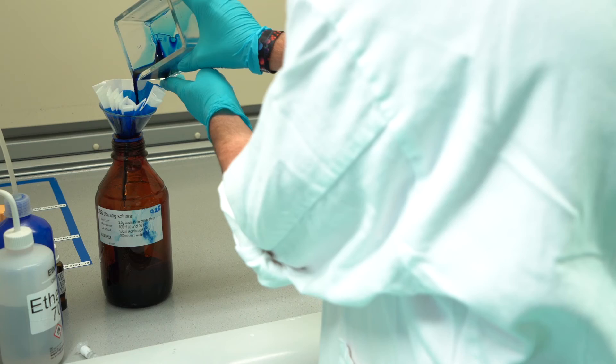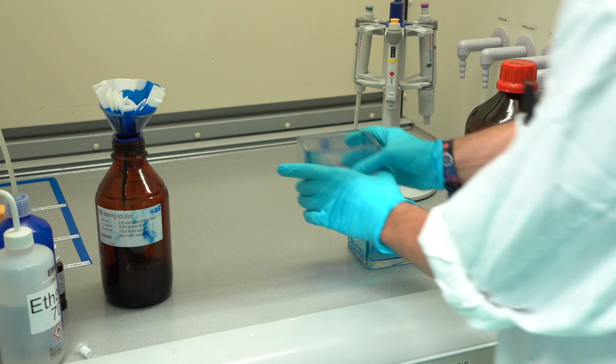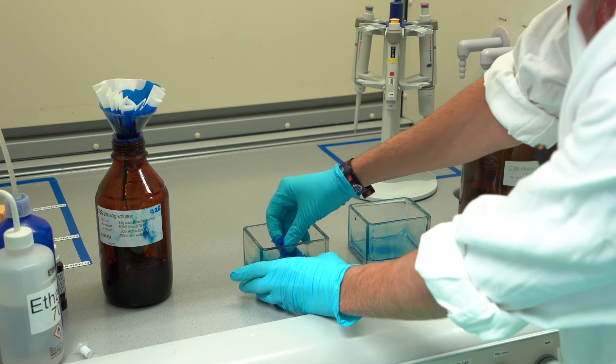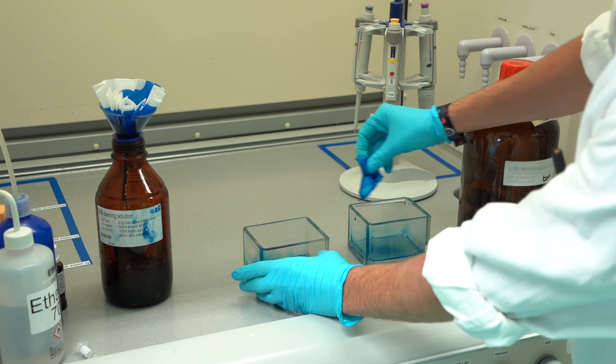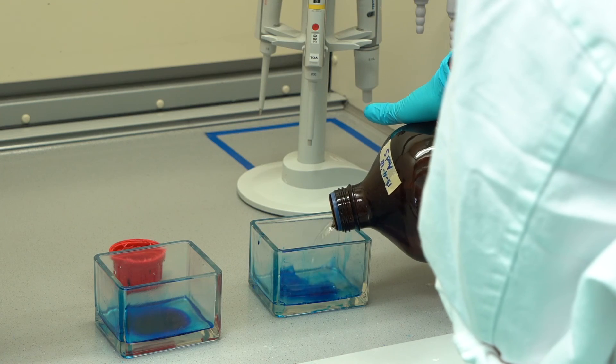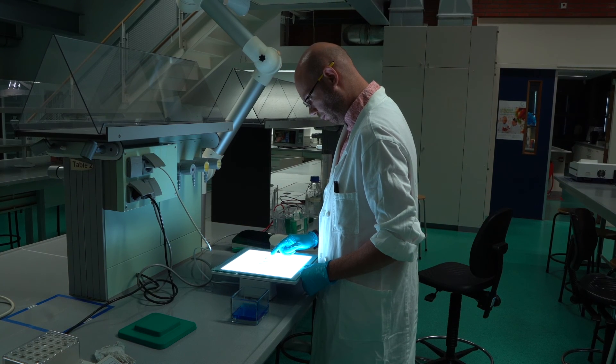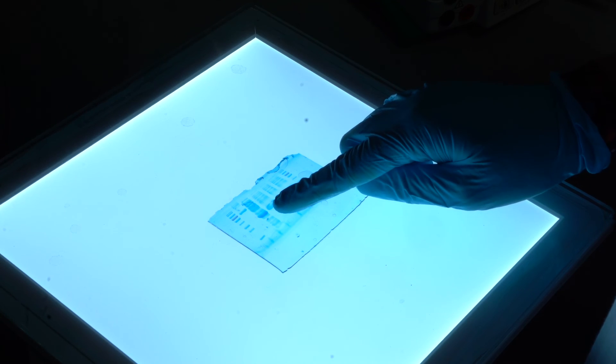Pour the excess CBB staining solution back into the bottle through a funnel with a filter. Remove the gel from the CBB staining solution and place the gel in the destain solution. Destain depending on your protocol. After this, the gel can be viewed on a lightbox.